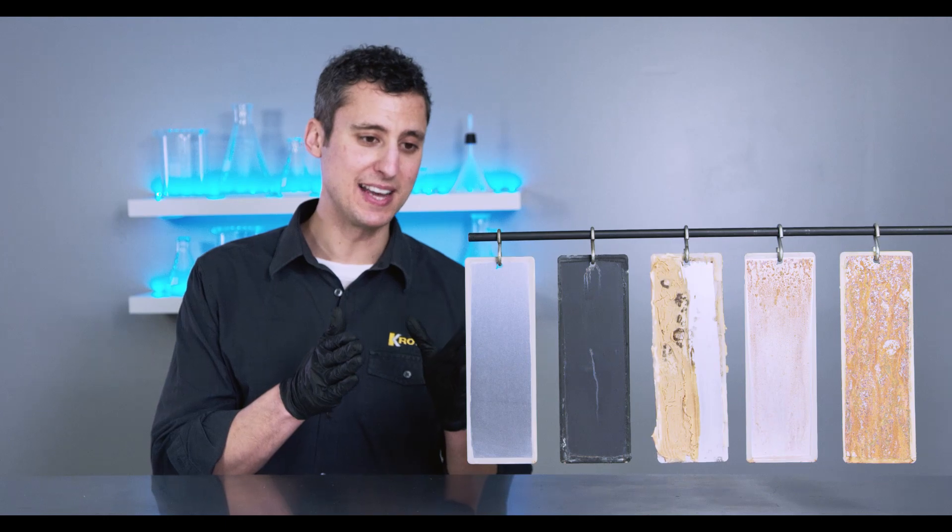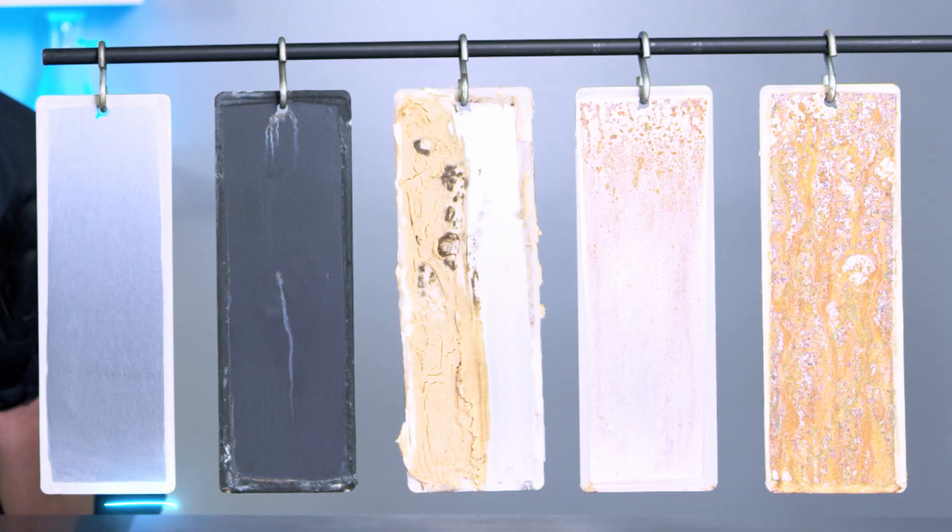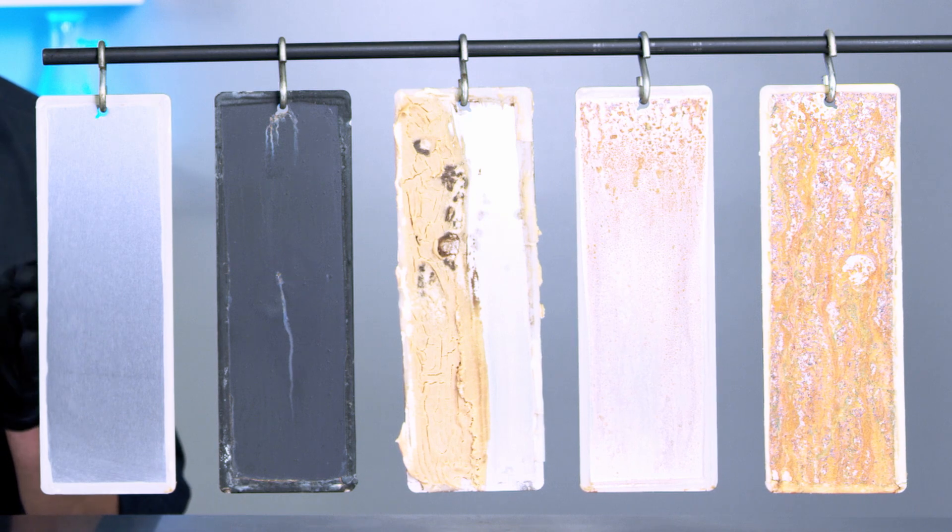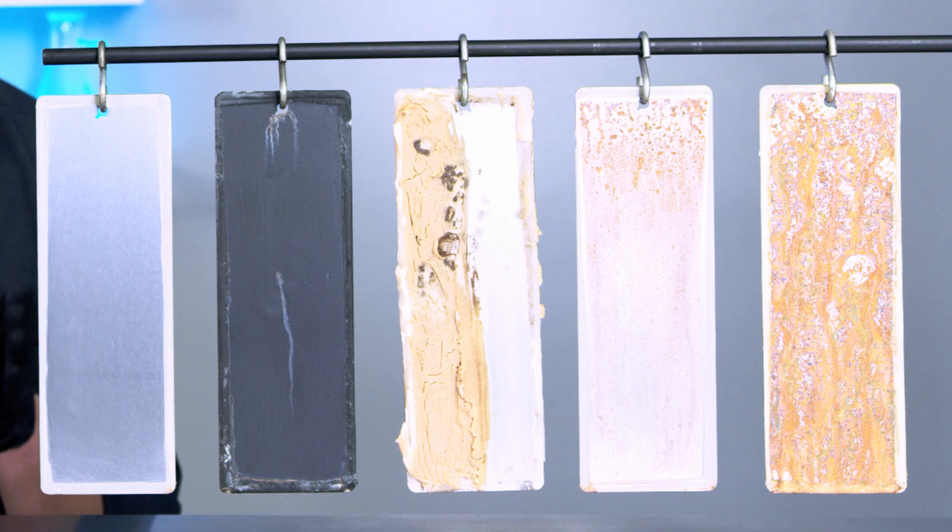Last but not least, we're going to take a look at this fifth panel where the Crown rust protection has been applied, and as you can see, after over 72 hours in the salt spray cabinet chamber, there's absolutely no corrosion on that panel. Now interestingly enough, the Crown product will last over 120 hours in the salt spray cabinet test before corrosion begins to form on that panel.